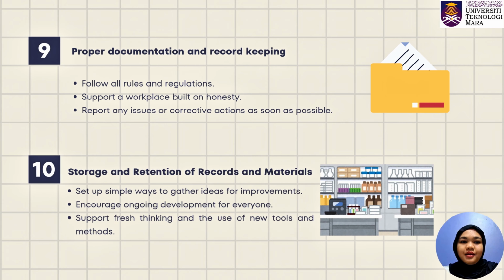And the last one, number 10. Storage and retention of records and materials. Set up simple ways to gather ideas for improvements. Encourage ongoing development for everyone. Support fresh thinking and the use of new tools and methods.